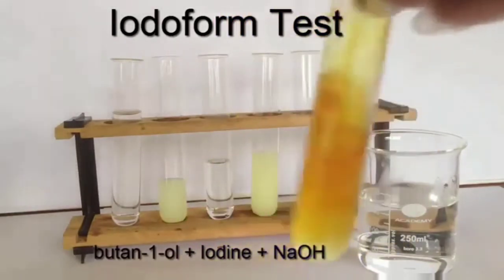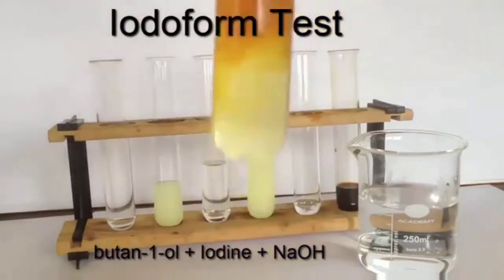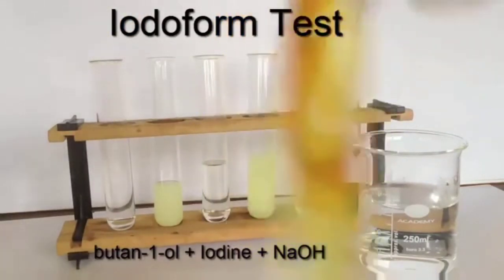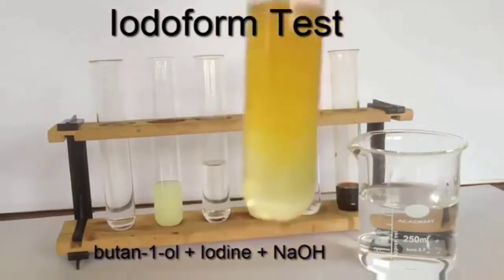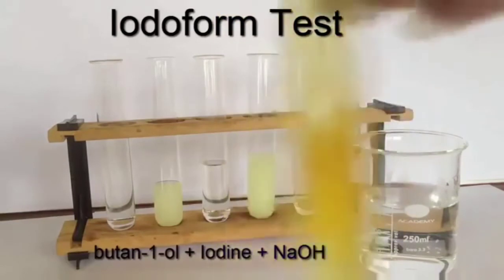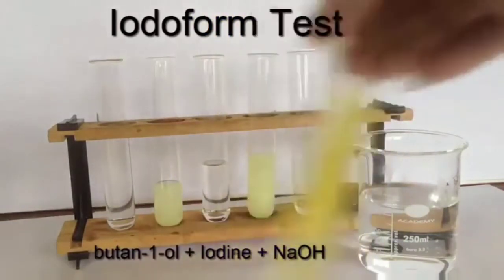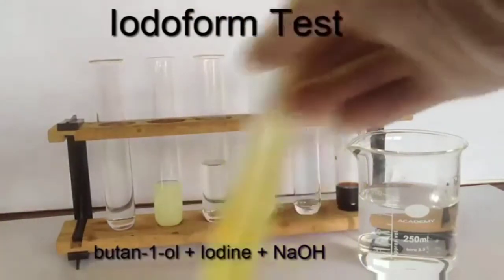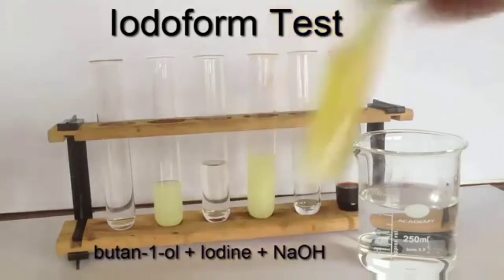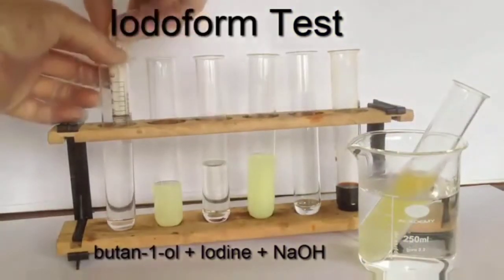It did need a bit more encouragement to see whether it was going to turn into a colourless solution or instead produce a yellow precipitate. So keep watching here. The colour is fading. I did feel the need to use the hot water bath in this instance to encourage it. Still not completely clear whether it's going yellow or brown at this stage, but watch it as it sits now in the hot water bath.